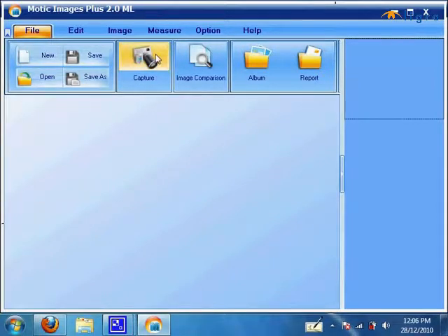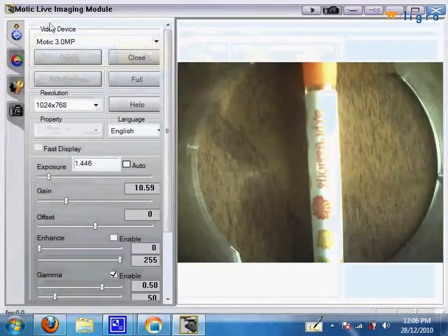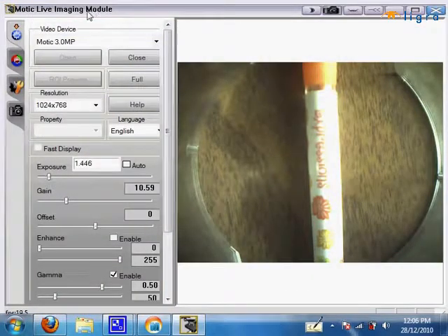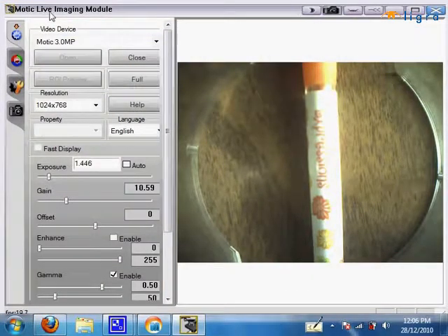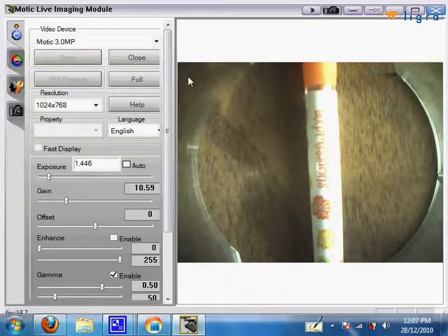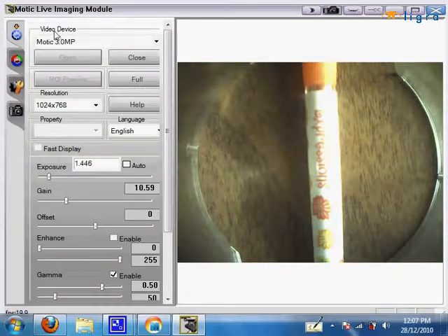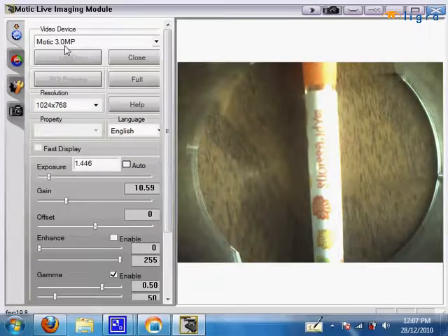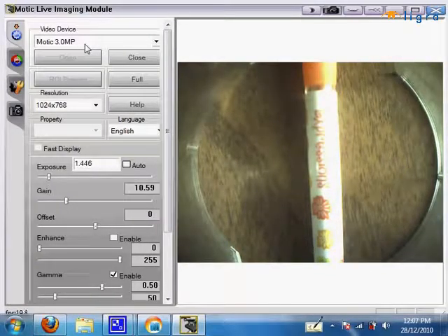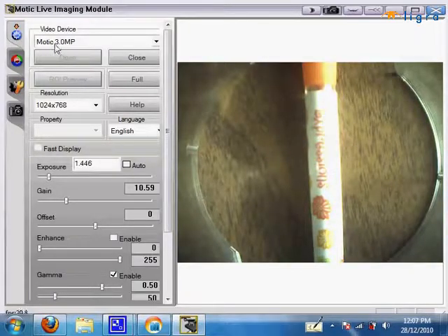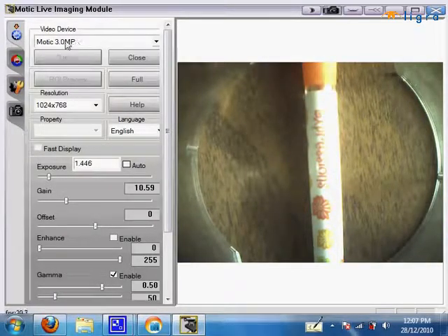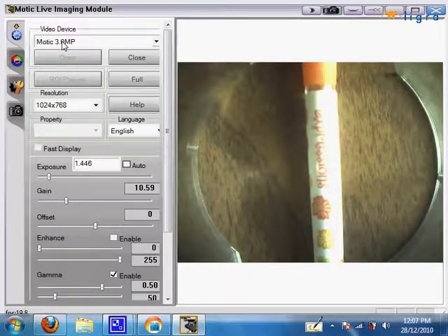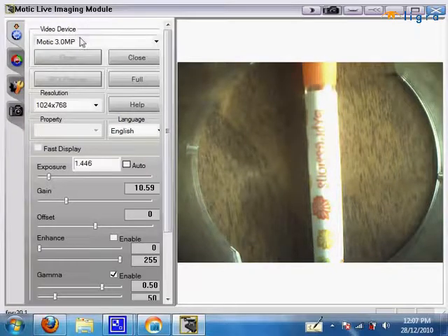Which is Motic Live Imaging Module. How you know your camera is connected to your software is under video devices it should say something. For mine it would be Motic 3.0 MP. It may not be the same case for you as long as it says something here. Your camera is connected to your software. And also another thing to note is down at the bottom FPS. If your FPS or your frames per second is higher than 0.0 that means your camera is connected to your software.